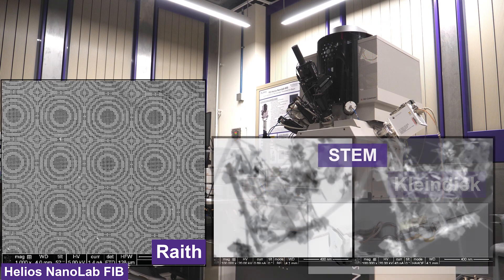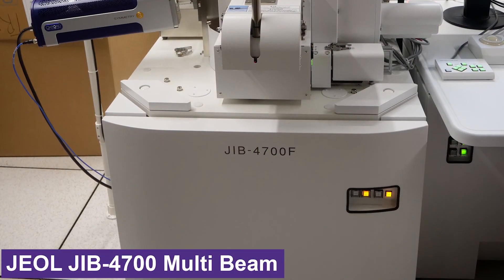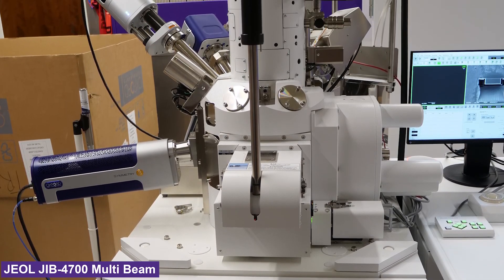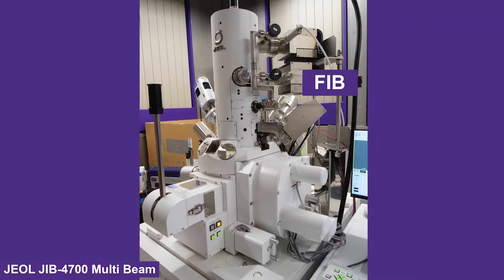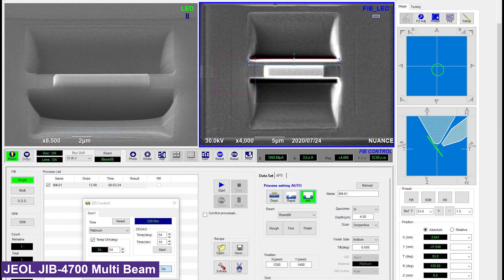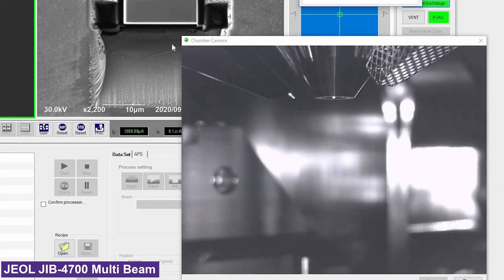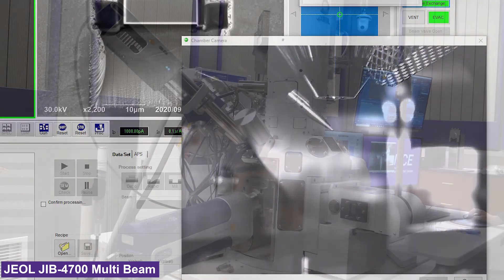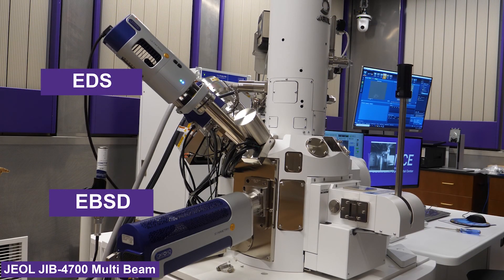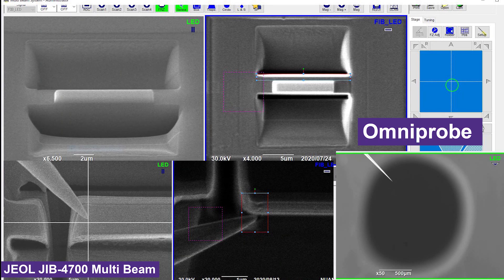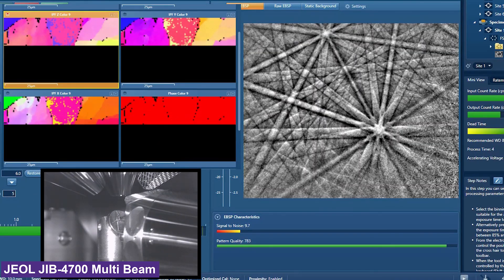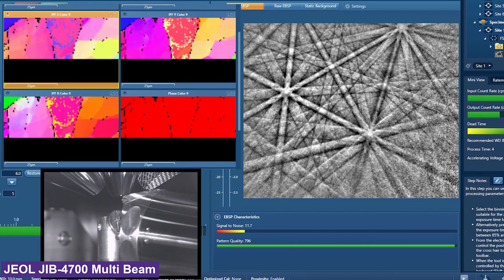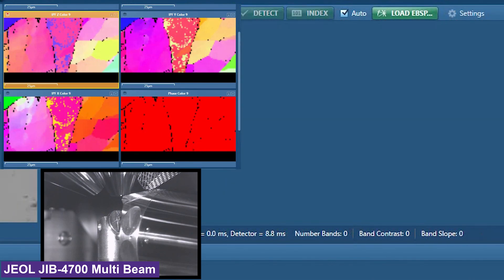This is the JEOL JIB 4700F multi-beam system. This is the newest microscope in the EPIC lab. Like the Helios, this has a gallium-sourced ion beam as well as a Schottky emission electron gun. It can perform TEM and atom probe sample preparation. It includes a gas injection system which can deposit platinum or carbon. It has an EBSD detector, an EDS detector, and a high-stability Oxford Omniprobe 400. The new Oxford Symmetry CMOS EBSD detector can operate at over 3000 index patterns per second. This instrument can also perform 3D EBSD, which is a new technique in the EPIC facility.